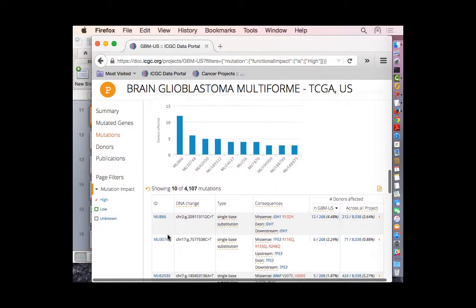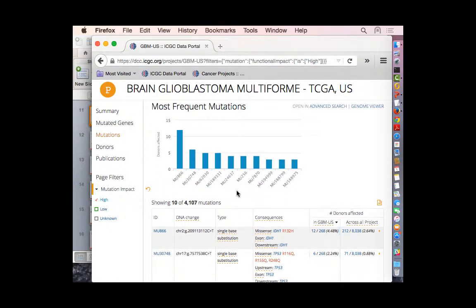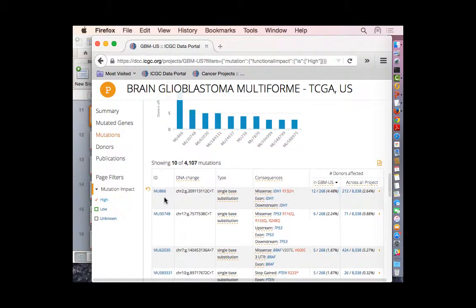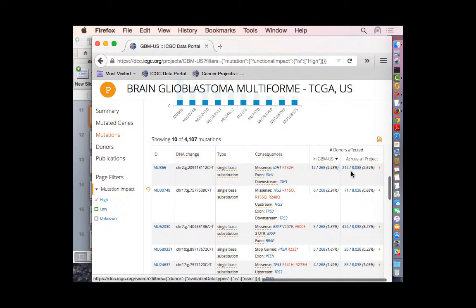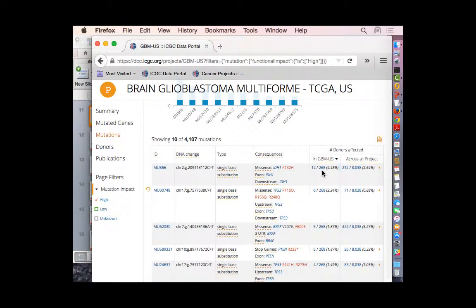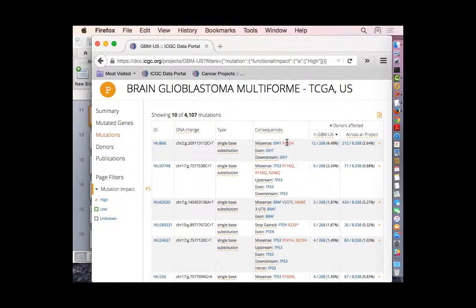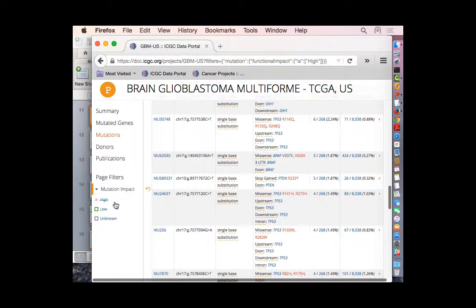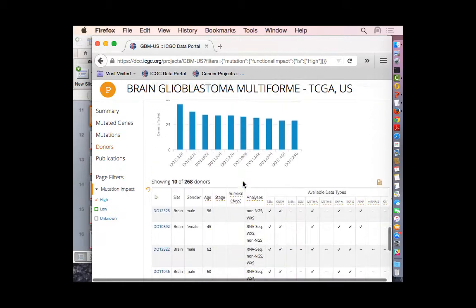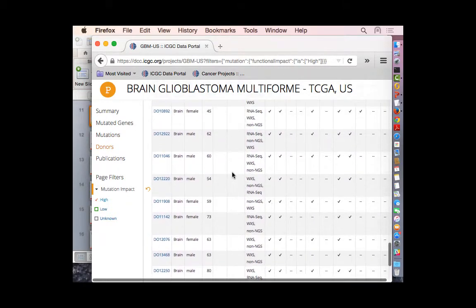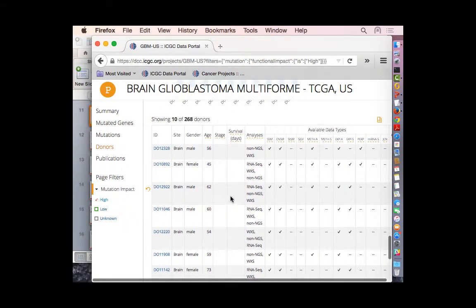Similarly, frequent mutations are listed as observed in this project. The top one has 12 donors out of 268 total. For each mutation, we show the genomic location, base changes, and amino acid changes — in this case showing missense. Colors indicate high impact or low impact: red is high impact. The last section is the donor section, which lists all the donors with this high impact mutation found in this project.